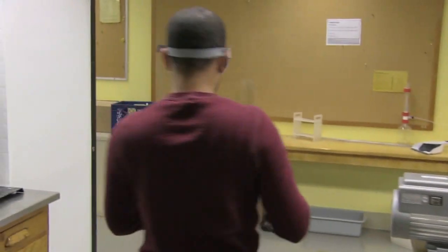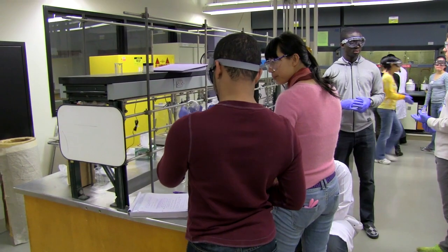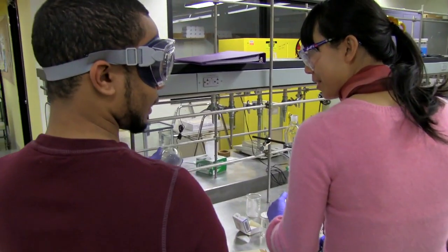And I started getting like crystals, I guess, on the side of my round bottom. I clutched my heart and I was like, finally. But the sample doesn't quite look right, and Tung Fe has something to say about that.